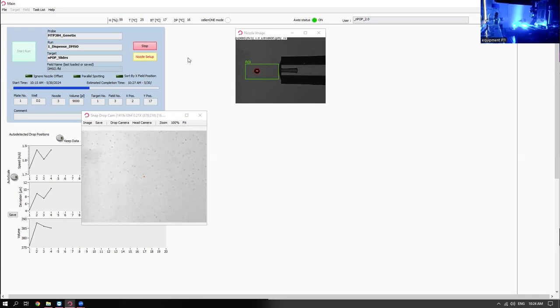Right. So the optimal concentration of cells when you're isolating is around 250 per microliter. And that can give us about an hour to dispense 1500 cells. If it's a lower concentration than that, it may take a little bit longer. If it's a significantly higher concentration, it may also take longer because you'll end up with more multiple cells in the ejection region. You'll see how we select whether or not we're going to isolate a drop with a cell in it. But I would rather be on the too low concentration side than on the too high concentration side.